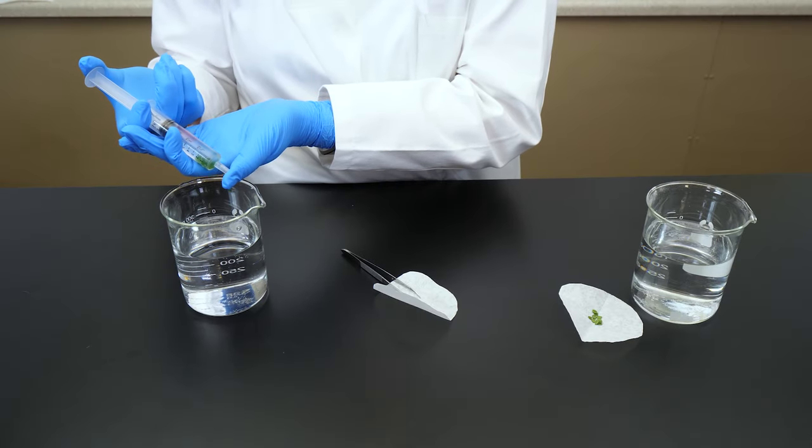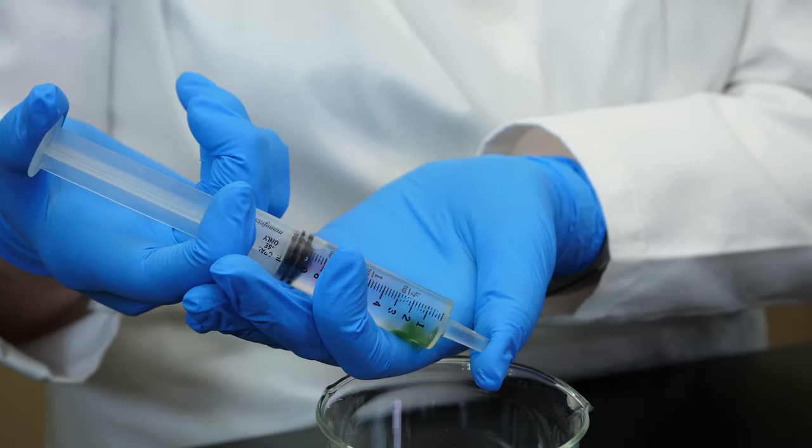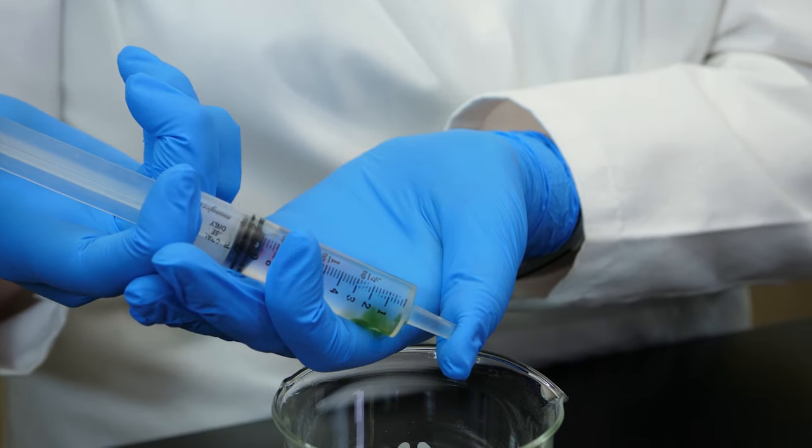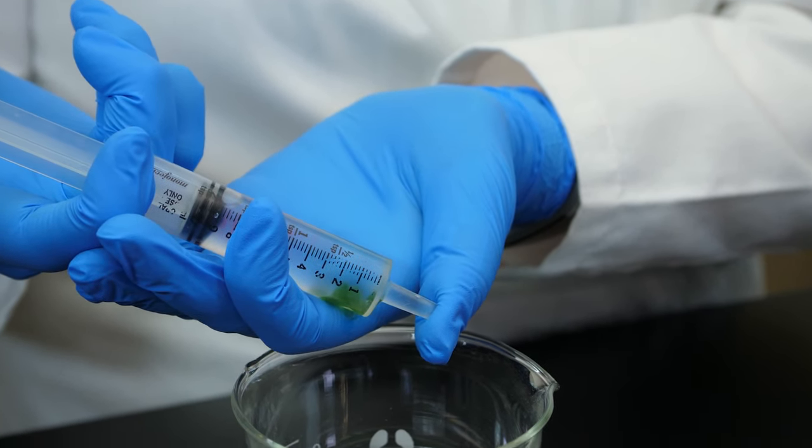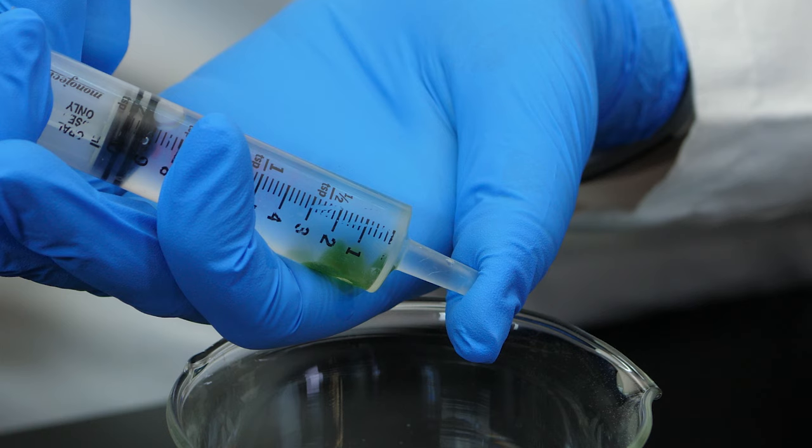While still holding the tip of the syringe closed, we depress the plunger to force some of the sodium bicarbonate solution into the leaf chads. This will ensure the chads get a sufficient supply of carbon dioxide.